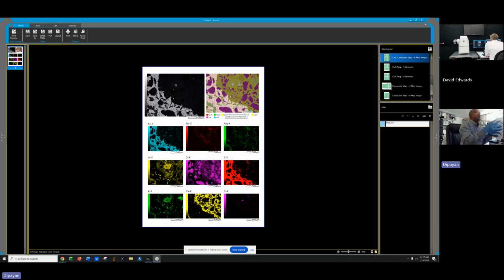But you have no option but to mask when you give importance to every element of every phase. That's when this happens. And that's why, for me, I think phase would be a better option. If I had only 2 or 3 phases, it's fine. But since I have multiple phases, like dolomite, I can't even see where my dolomite is unless I go to the magnesium map. I can't even see where my feldspar is until I go to my individual maps. So I have to keep everything in this case.